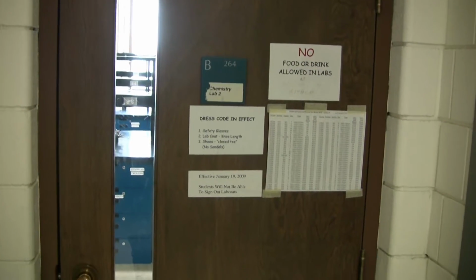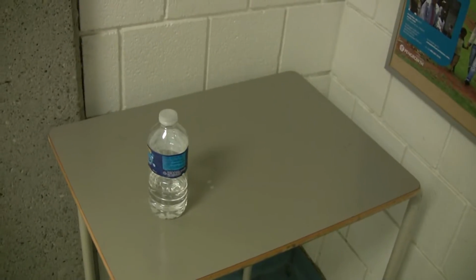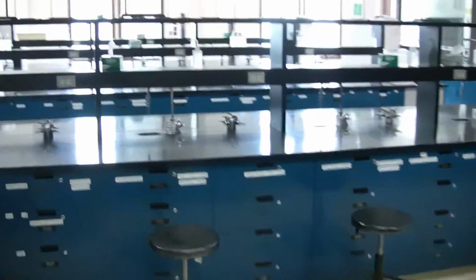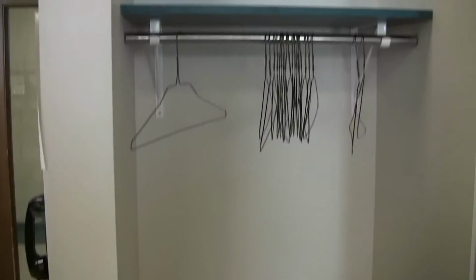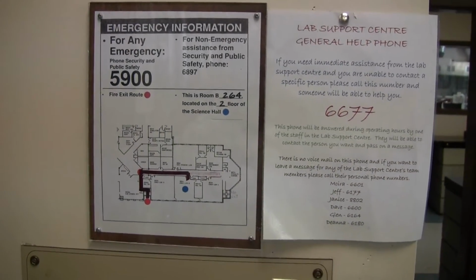As you approach the door to the lab, there will be a desk outside for food and bottled drinks. Upon entering the lab, directly to your left or right will be a cubbyhole where backpacks will need to be stored. There is also room for coats and whatnot. There is also additional space for backpacks. There are several emergency plans right next to the door as well.